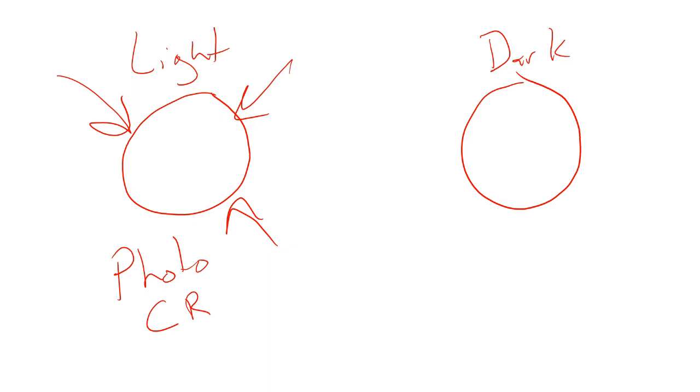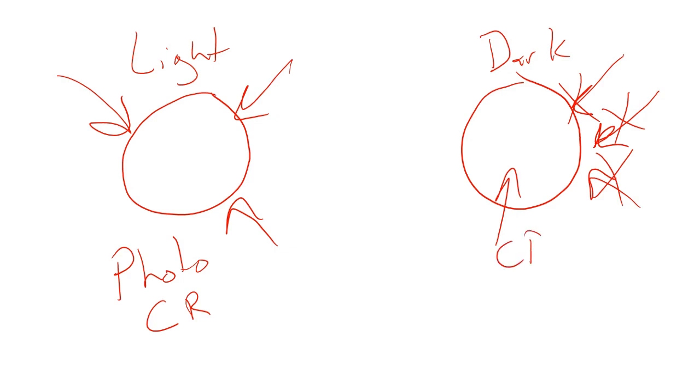They're trying to grow. In the dark bottle, sunlight cannot get in. So sunlight is going to be rejected, so it is not able to get inside. So the only thing happening inside of here will be cellular respiration. So what I'm pretty much doing is figuring out the rate of photosynthesis of Neshaminy Creek.